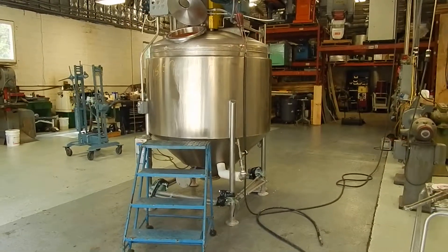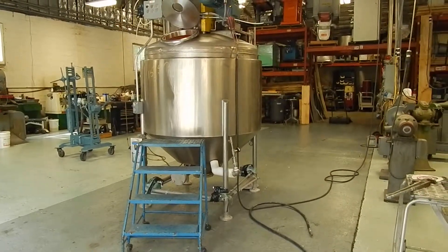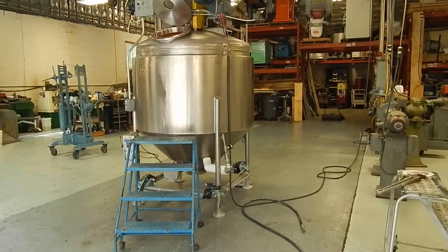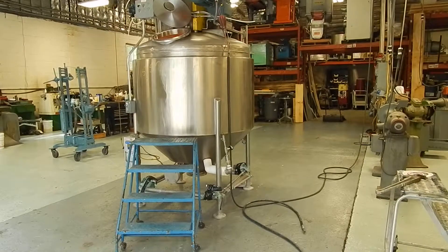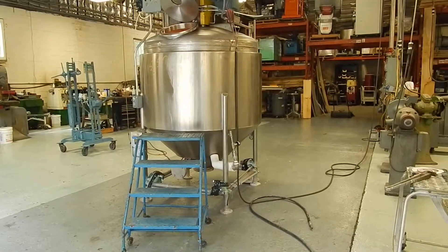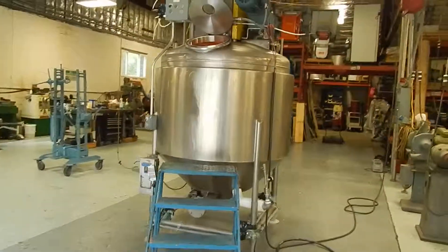Hi, this is Dave at Champ Trading. What we're doing today is demonstrating a 500 gallon jacketed vacuum scrape agitated processor. It's a sanitary pharmaceutical grade unit formerly running toothpaste, made by Casale Industries here in New Jersey.